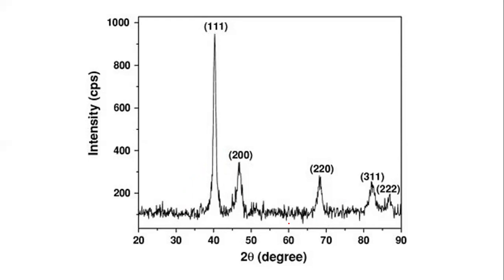When I look at this kind of spectra and there are sharp defined peaks, then basically this is an XRD spectra. So then we understand that our compound is crystalline in nature. The material for which we recorded the spectra is crystalline.